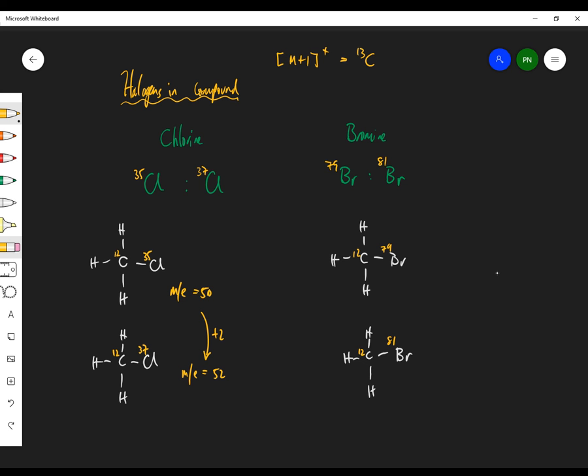Now, here we go. 79, 80, 81, 82, 92, 94. I think the mass over charge of this one is 94, and the mass over charge of this one is going to be 96. That's going to be a 2 as well.